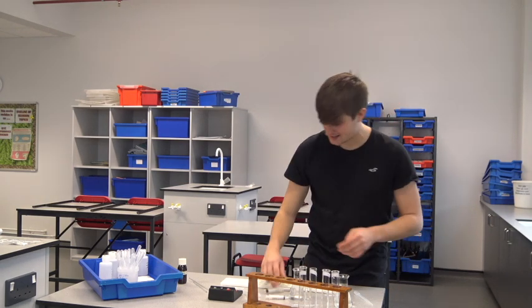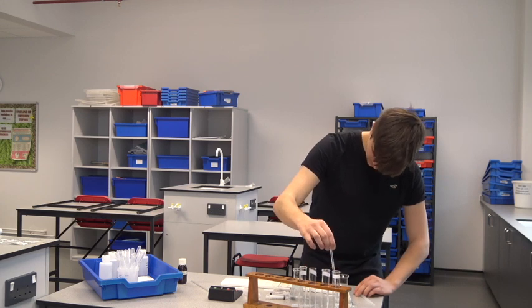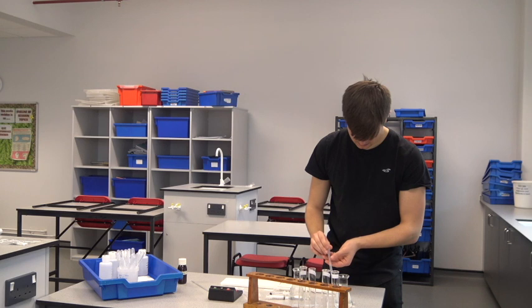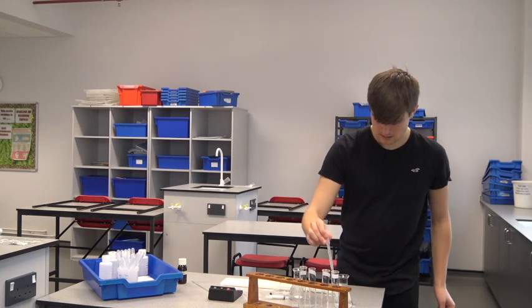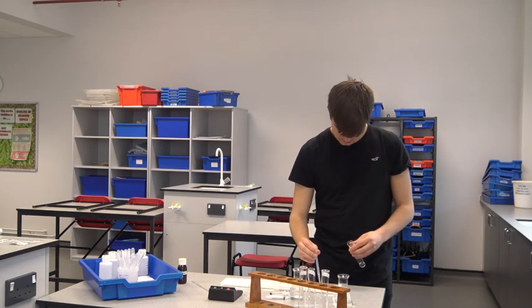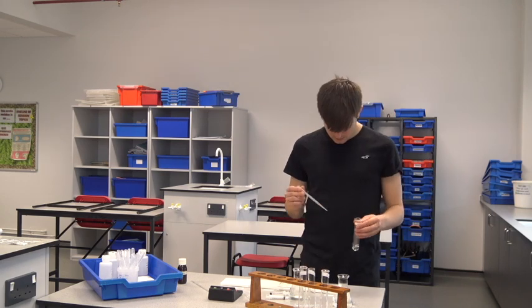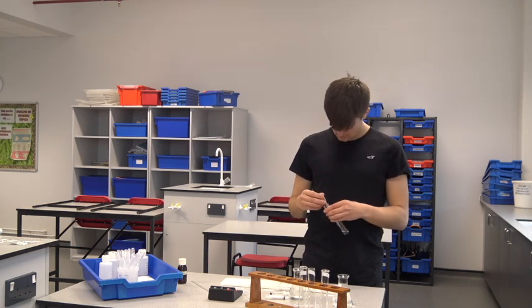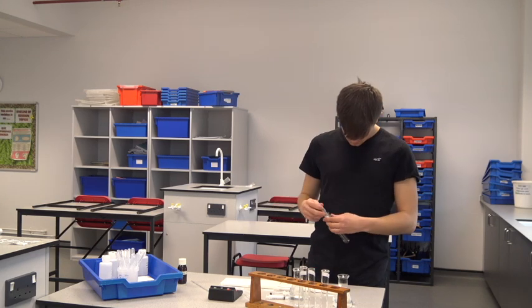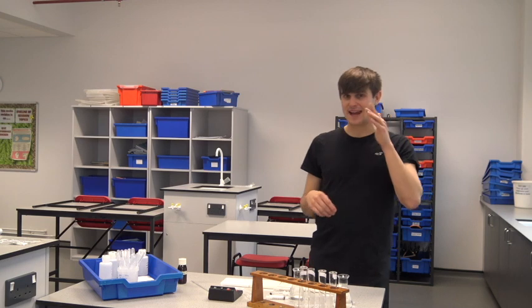Three, two, one — let's do this. Every 10 seconds I'm adding a sample to the spotting tile. Keep stirring. That's my pH 3 solution done, and I'll show you all of the results at the end of the practical.